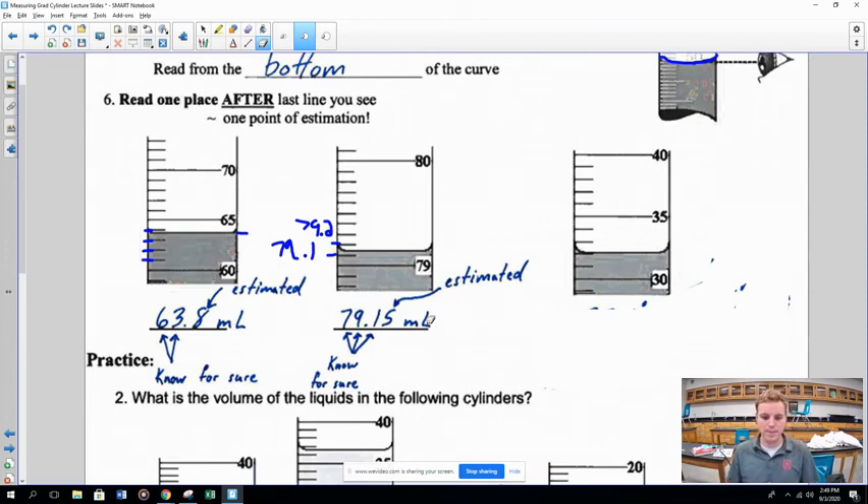Notice in the first measurement we went to the tenths place, but in the second we went to the hundredths place. That's because the second graduated cylinder was more precise — its tick marks go to the 0.1 place, whereas the first only goes to the ones place. The tool you're using determines how accurate and precise your measurement can be.